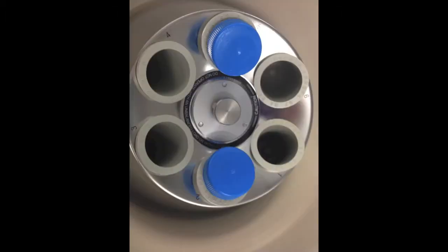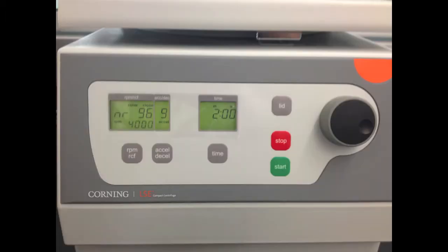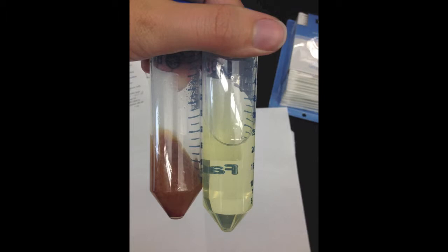Your instructor will show you how to properly operate the centrifuge. You should centrifuge the vials for 2 minutes at 4000 rpm. After centrifugation, the vials will have two layers. Carefully pour the liquid layer into another tube and discard the solid layer.